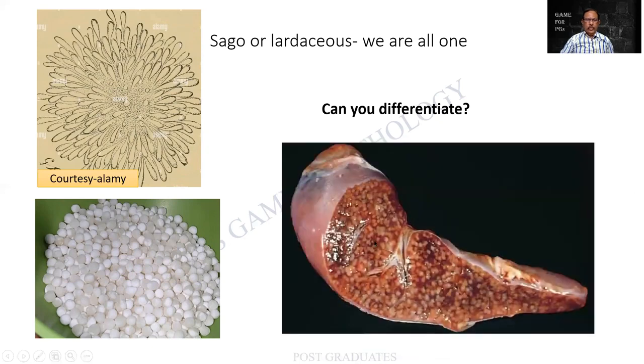And look at this over here. There are multiple nodules. You may get a specimen of the spleen. So again, the hilum is over here. There is a capsule. The cut surface is showing multiple small nodules uniformly distributed throughout. So what are all the differential diagnoses you can think of? Pause for a minute. See whether you are able to recollect the differential diagnosis. Tomorrow this might be a specimen. As I told you earlier, do not make a histological diagnosis on a gross specimen.